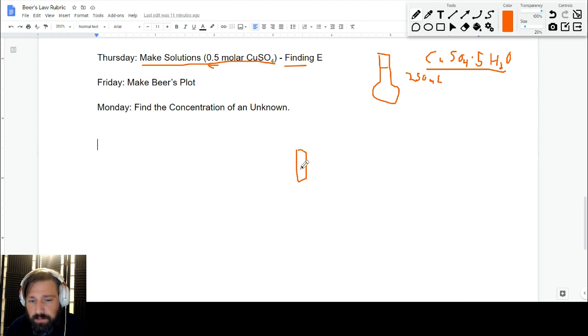I'll explain it now. There's two sides to these cuvettes. There's a rough side and a smooth, clear side. They're made that way to let you know that, hey, this is the rough side. Don't shine the light through the rough side. Shine it through the nice, clear side. That's the side that was made to be perfectly smooth and without any imperfections. So use that side.